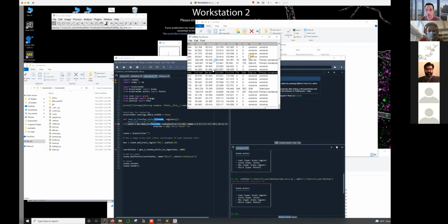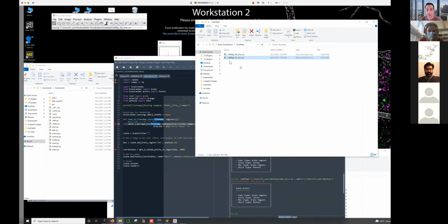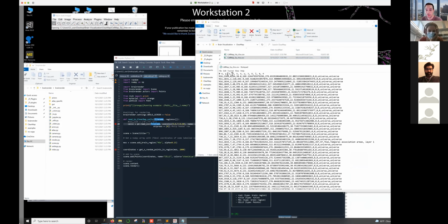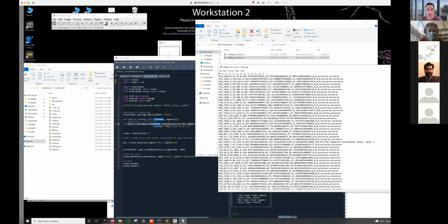This can be a little bit confusing looking just at this table. If you're ever working with CSV files and you're opening them up and something doesn't look quite right, just look at them as text files. You can see here the reason why this is a little bit funny is there's actually several columns with the same name. So there's XYZ, XYZ again. So these are the columns that you should actually use when you're looking for the columns in Python. Looking at them in ImageJ can be a little bit confusing because those X, Y, and Z kind of replace each other. So that's why it doesn't look like it's right. But these are the correct columns, 5, 6, 7, 9, and 10.